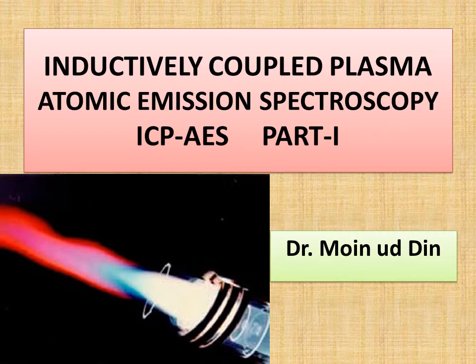Hello dear students, I am Dr. Moinuddin. In this video we are going to discuss inductively coupled plasma atomic emission spectroscopy. It can be abbreviated as ICP-AES. We will discuss this technique in detail. So today there is part 1 of this technique.